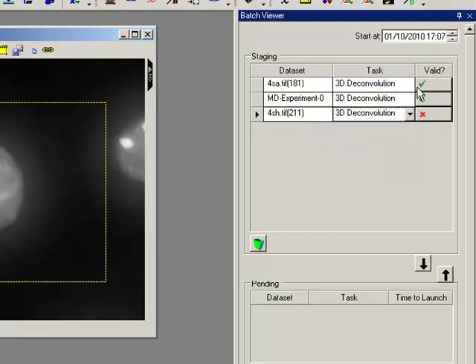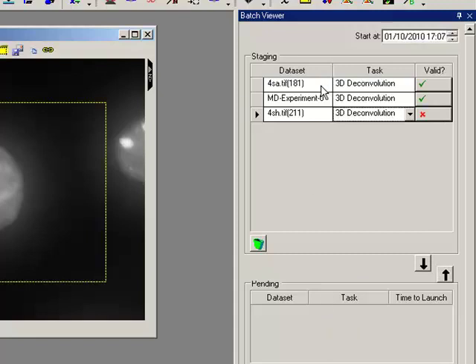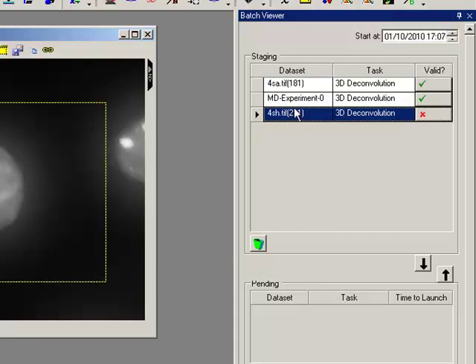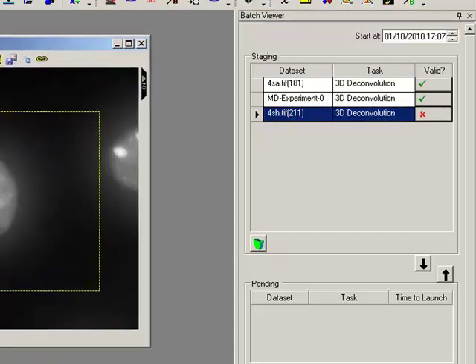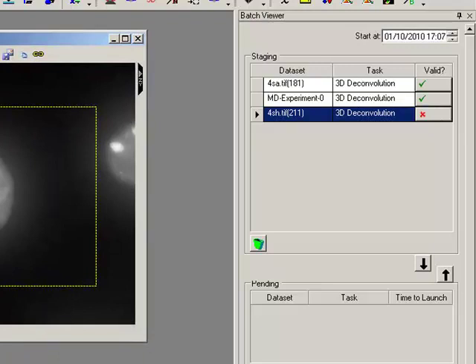We get a little green tick here when they're ready, and that means that once I've set the time I can send them to the pending area and then they'll be ready to deconvolve at a certain time. So we can see for this one here we've got a little red cross. Why might that be? That's actually because the optics information isn't correct, it's not filled out on this dataset.